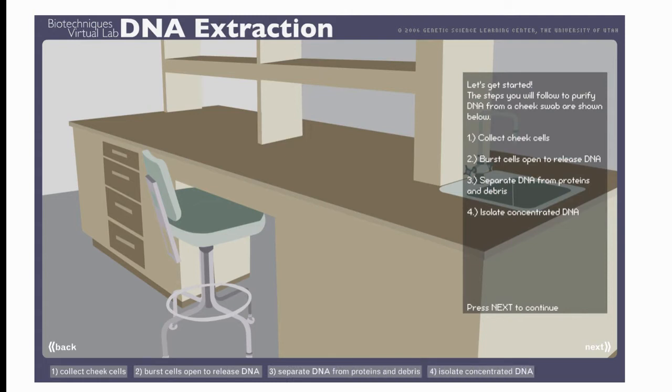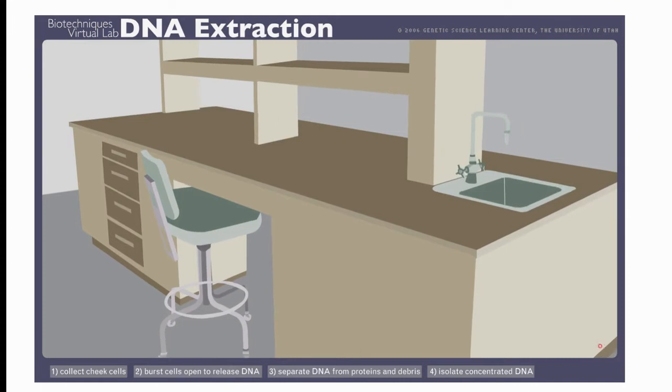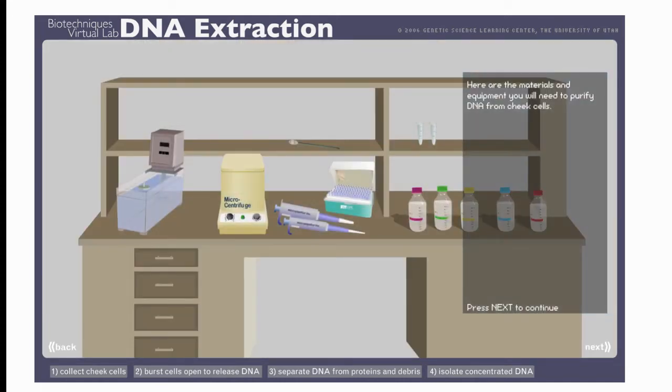Our procedure will be to collect the cheek cells and then break those cells open to release the DNA, and then we'll separate the DNA from proteins and other cellular debris. Let's go ahead and click Next to continue.